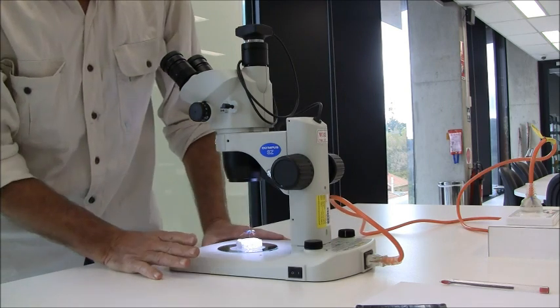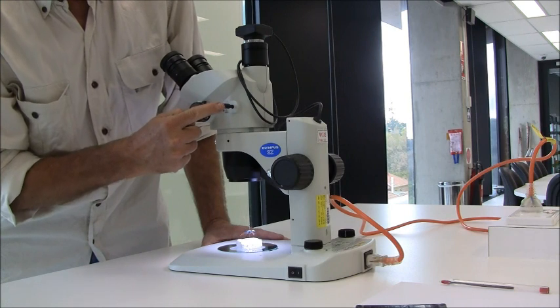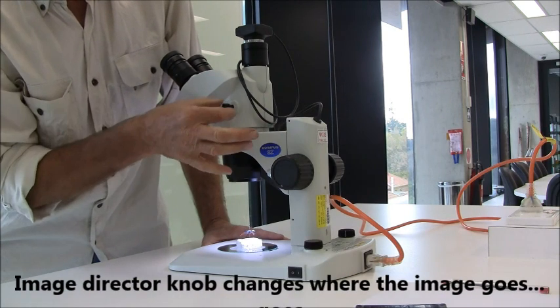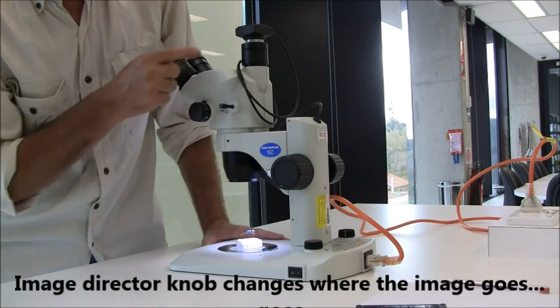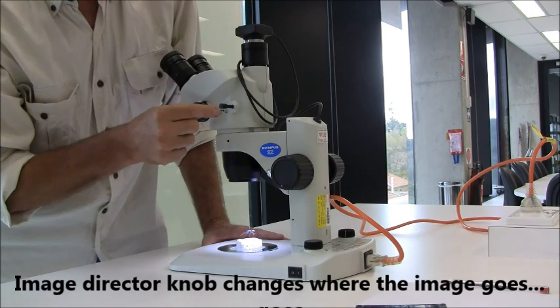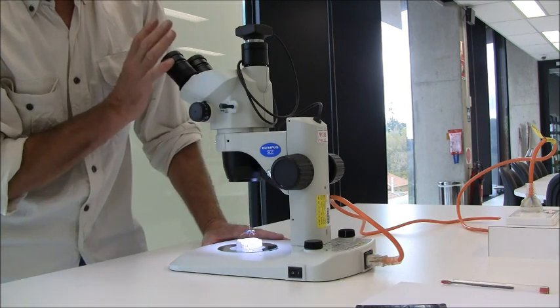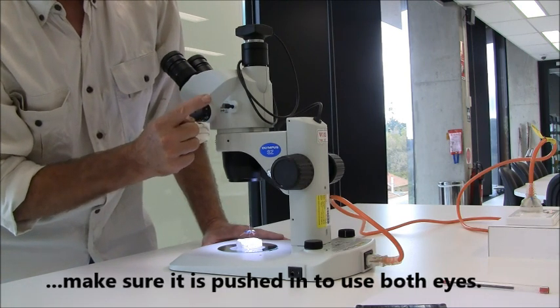The next thing in setting this up is to make sure that this little knob is pushed in. It's pulled out to send the image to the camera and then to your computer, but if you want to use it with both eyes, that knob has to be pushed in.